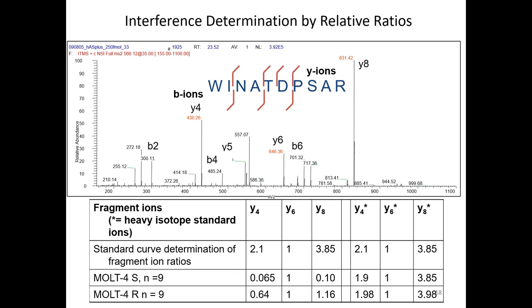When you are using the same model of instrument, whether in this lab or in a different lab, you should always get this pattern of both mass-to-charge spacing and intensity. If you're using a Waters triple quad, it'll always give you the same pattern and intensity. If you're using a Thermo one, it'll always give you the same pattern and intensity.